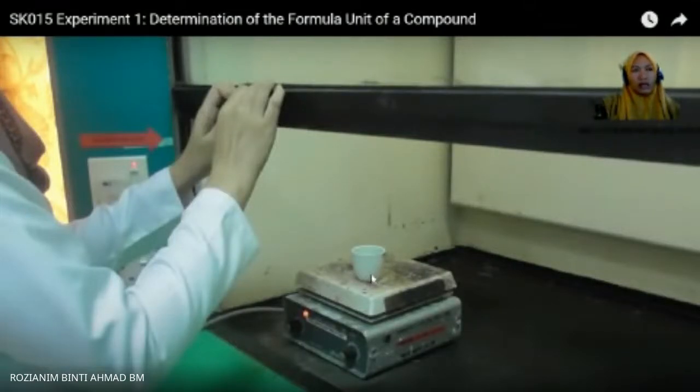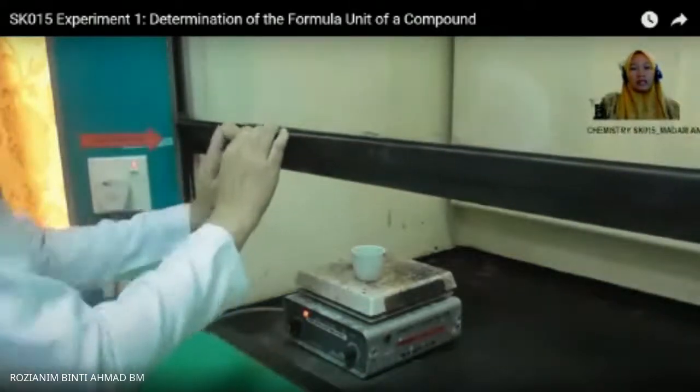acid or not. Kalau dia tak dissolve, according to procedure number 4, dia kata kalau tak dissolve, masuk lagi 5 ml hydrochloric acid, tetapi kita check, make sure bila kita add more hydrochloric acid, jangan lebih daripada 20 ml. Kenapa? Sebab bila kita undergo proses heating, kita nak make sure our compound produced is totally dry. So bila banyak hydrochloric acid, acid tersebut akan jadi excess and it requires a lot of time. So masa kita akan ambil lebih banyak lah untuk check produk kita terhasil.